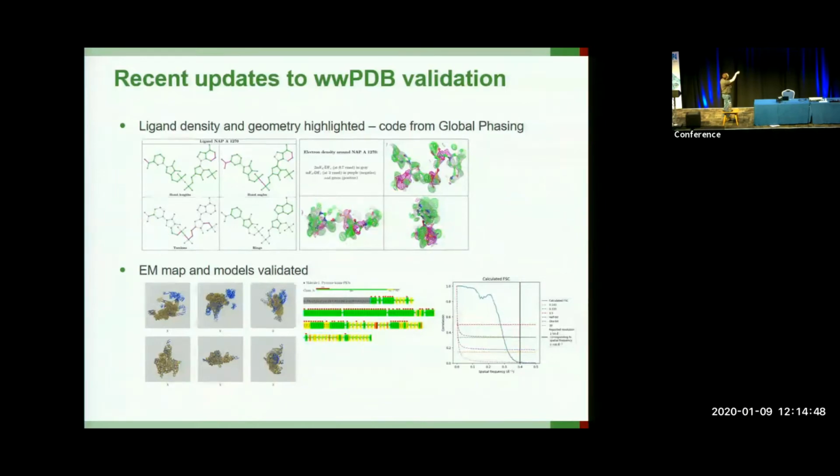All the red spotty bits are where the atoms are not in the volume, so the residues don't fit. And if you give us half maps, which hopefully everybody will, we can calculate FSCs and compare your resolution with our resolution. This one's slightly off, so that's the depositor's suggested resolution. The real one will be somewhere a bit further down here.